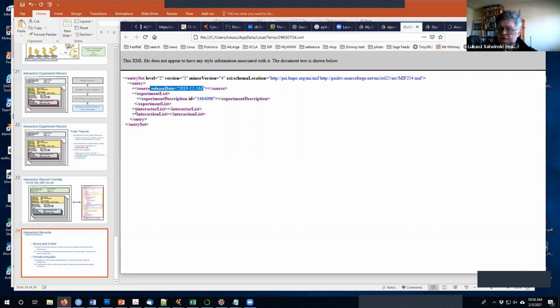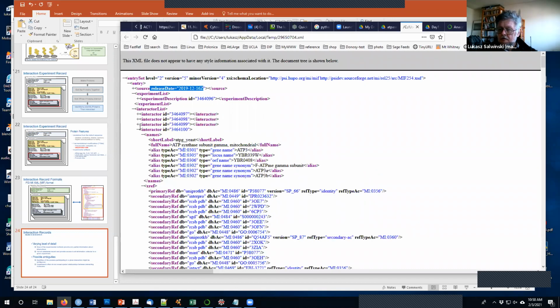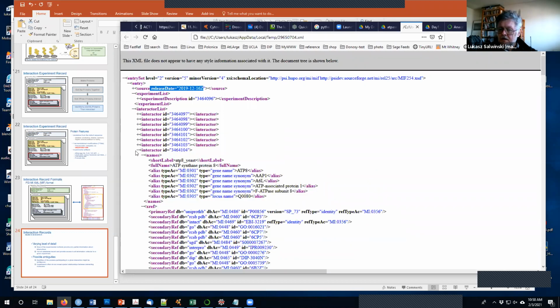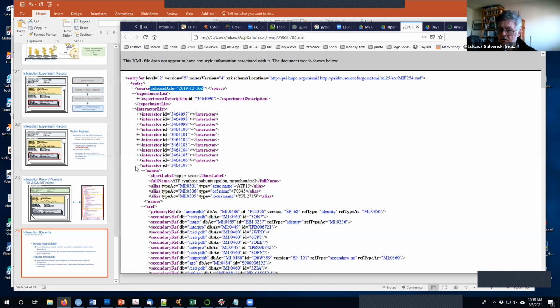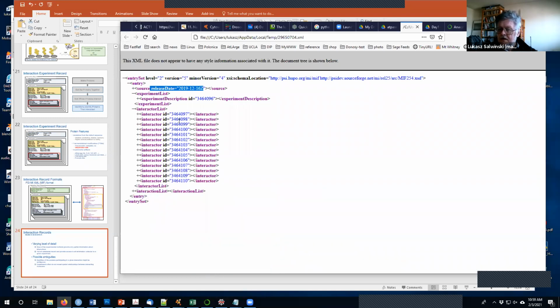So once we unfold this, we do have now 1, 2, 3, 4, 5, 6, 7. A lot of interactors here. Keep going. That's a lot.